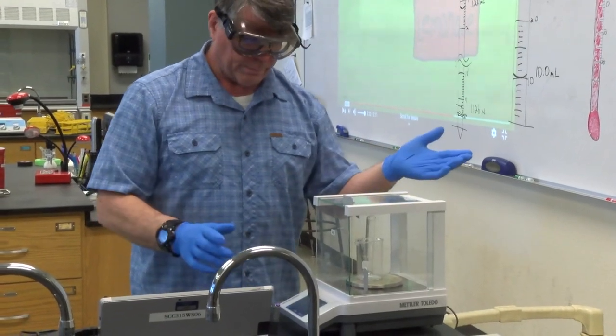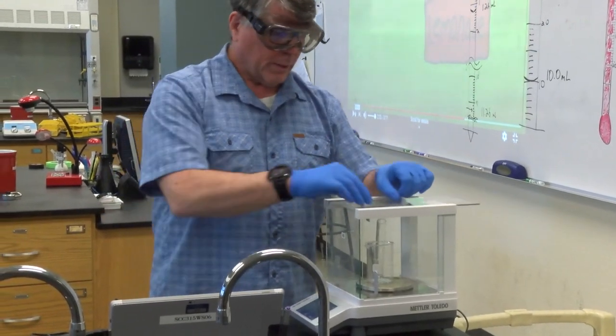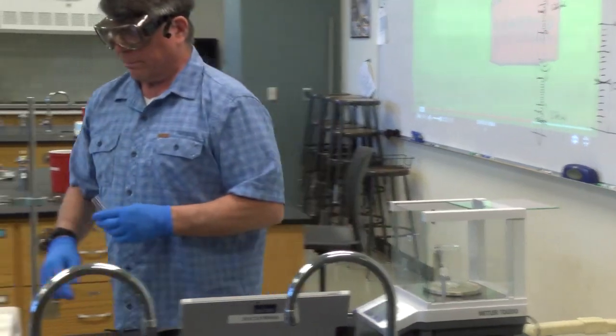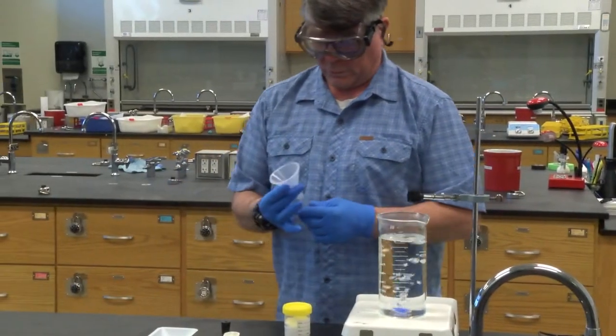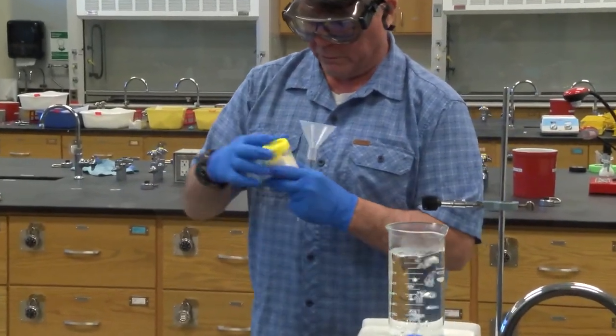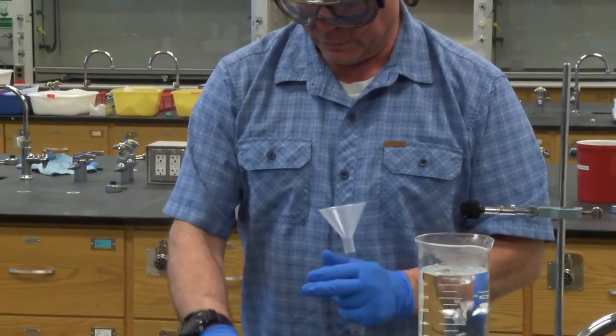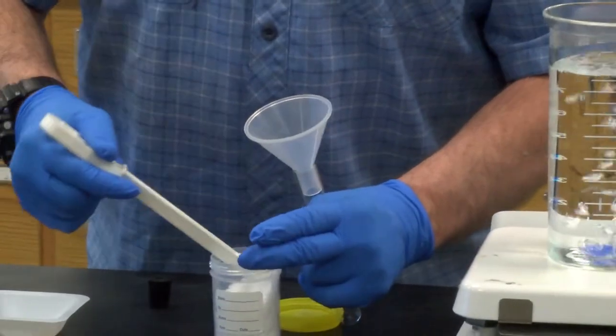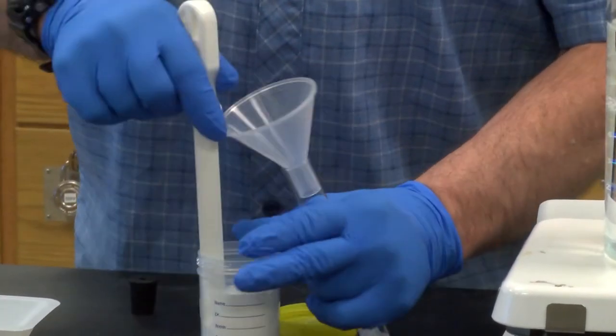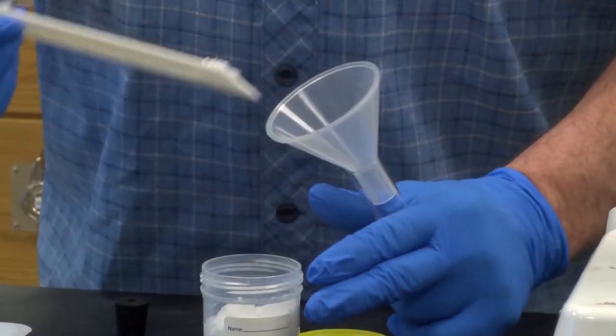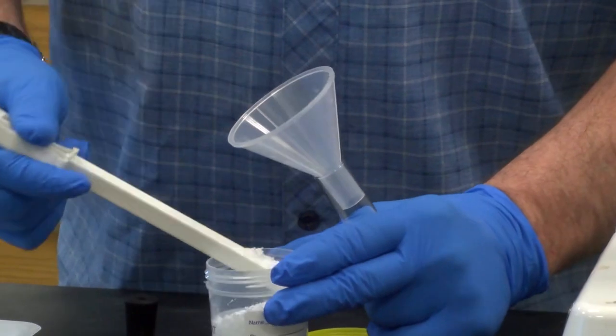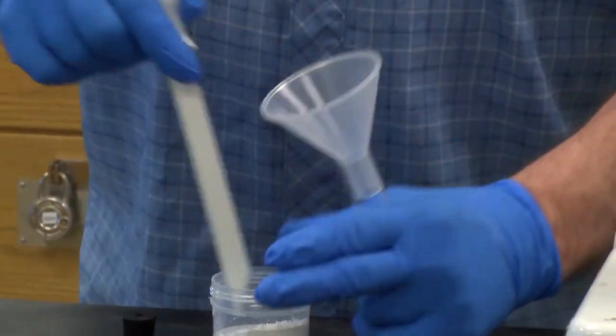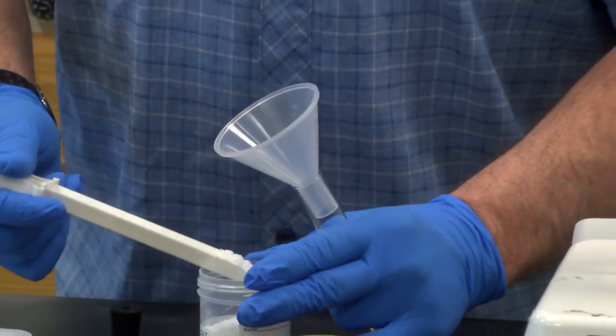So tare it out, it says zero, take the test tube out, powder funnel, solid organic solvent, spatula. This part gets messy, but we're just going to fill it right on up to about where that rubber stopper was. And however much that is, that's how much it weighs.